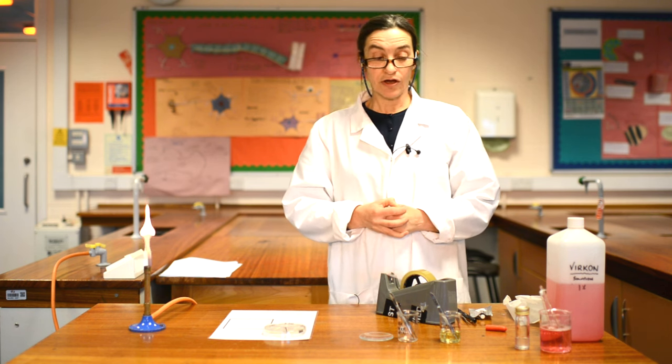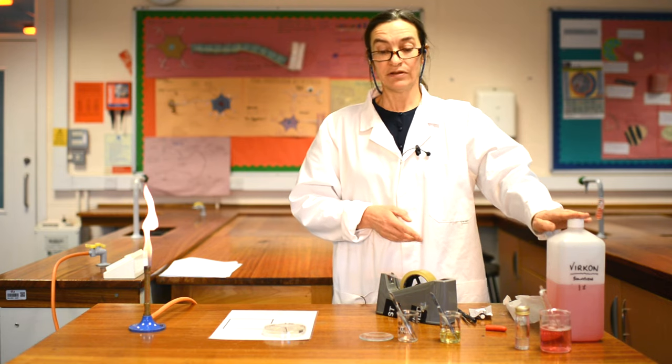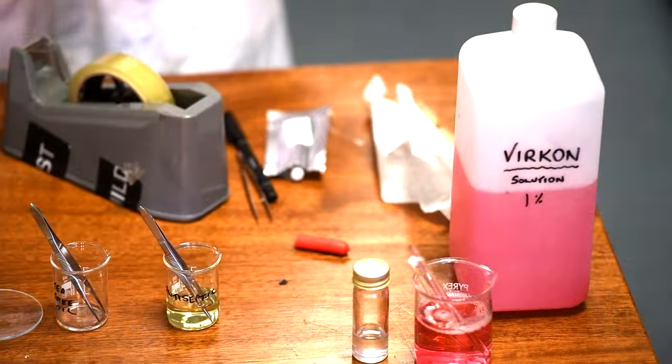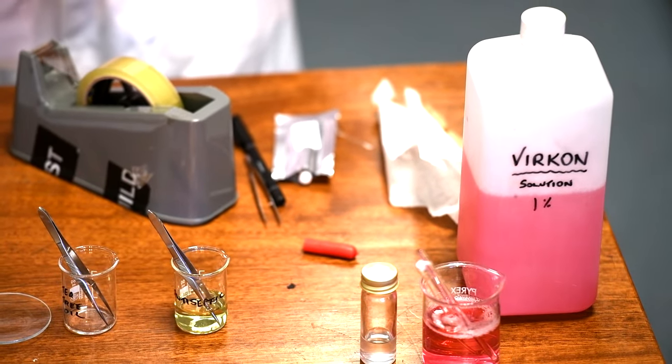After that has gone, your job is to disinfect your table. If you have accidentally spilt any E. coli, you're not going to spread the E. coli around to the next person who comes in after you.